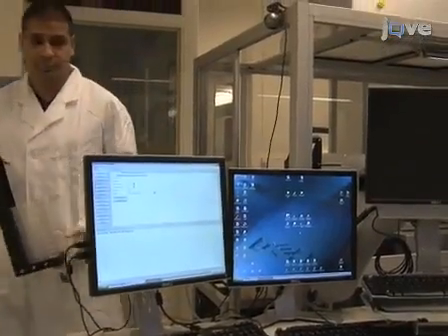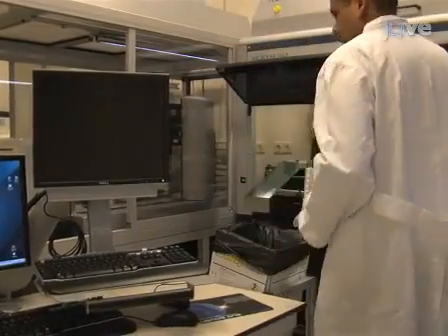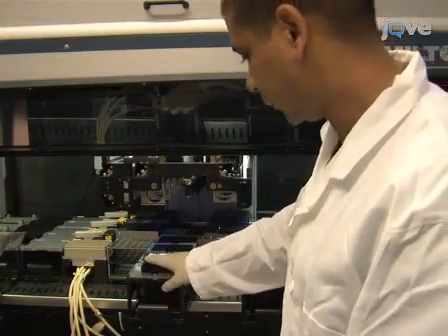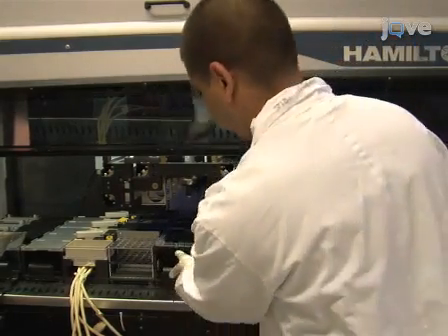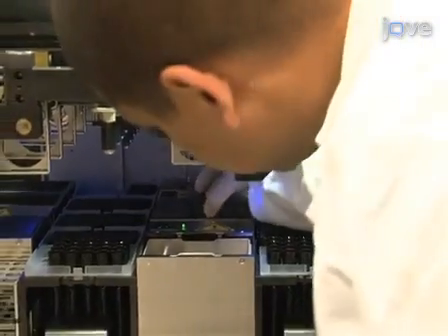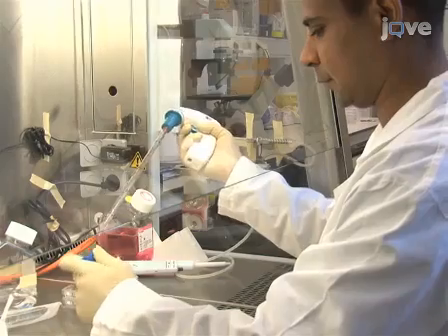To begin the cell culture process, prepare the automated cell culture system for the input of cell culture plates. Load consumables such as pipette tips, cell culture plates, and assay plates into the system. Also, ensure there is sufficient cell culture media, PBS, and trypsin in the system.